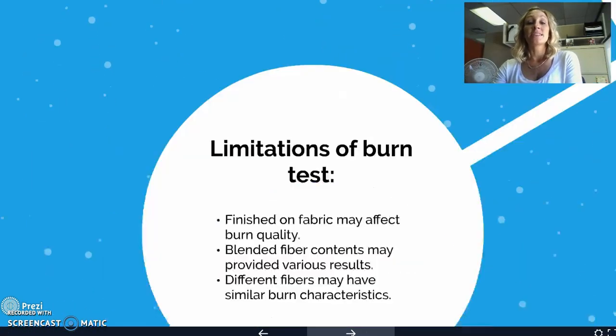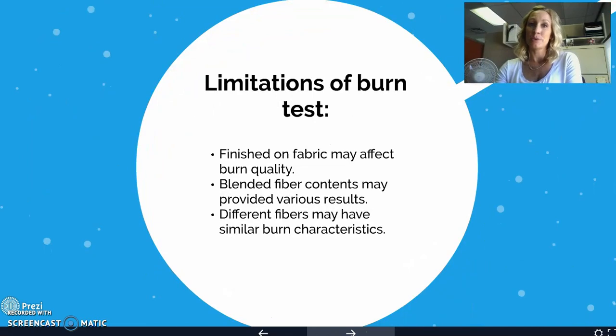Now, like I said, there are some limitations to a burn test. The burn test is not 100% satisfactory for identifying fibers. It would be really hard to differentiate between cotton and rayon because they both come from a cellulosic group, so they're going to have similar burn qualities. The test has some other limitations.